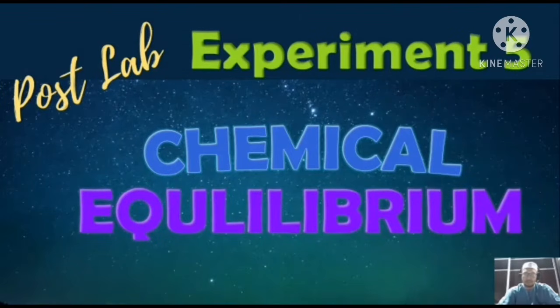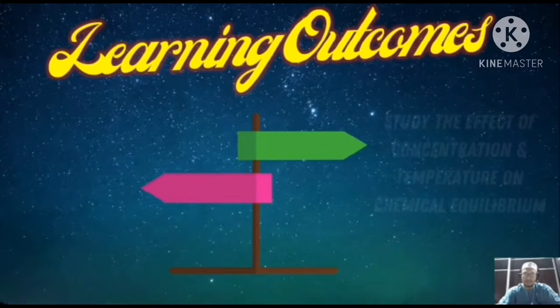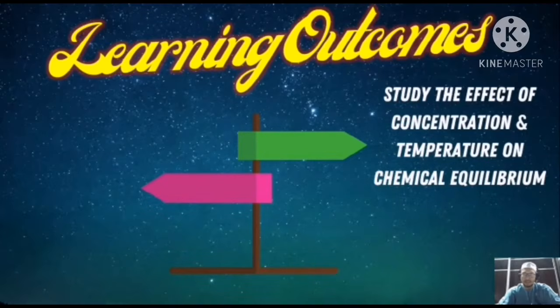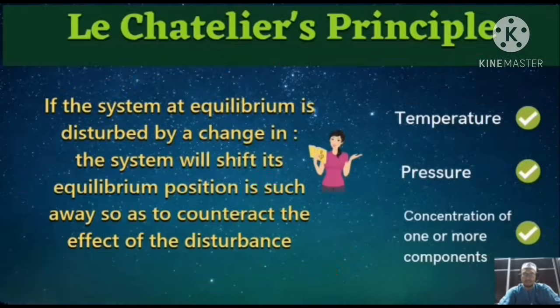Experiment 5: Chemical Equilibrium. Learning outcomes. Number 1: study the effect of concentration and temperature on chemical equilibrium. And number 2: determine the equilibrium constant Kc of a reaction.